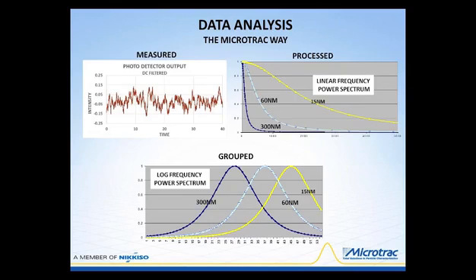That has the characteristic of what's called a Lorentzian function as a function of frequency.